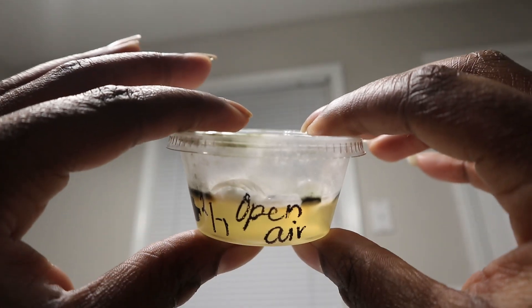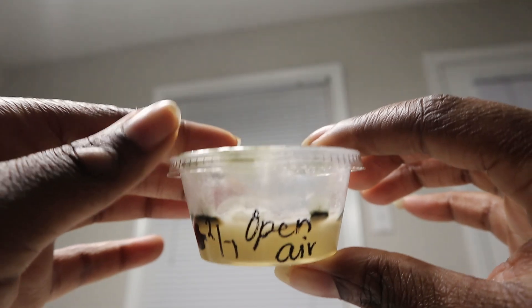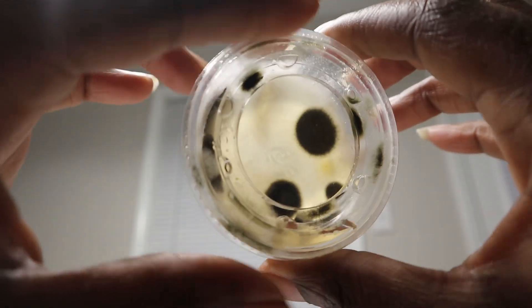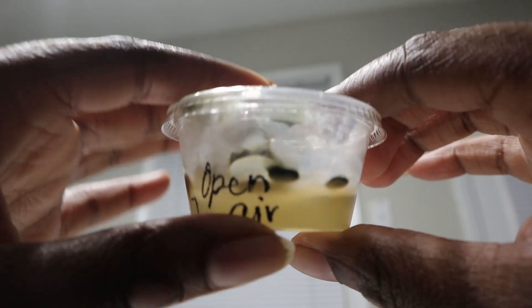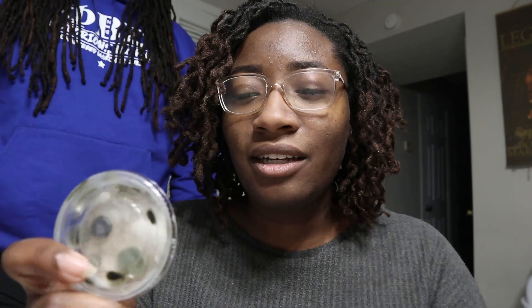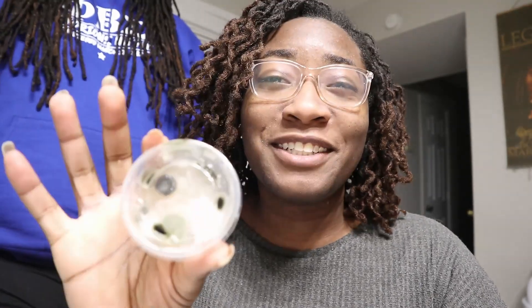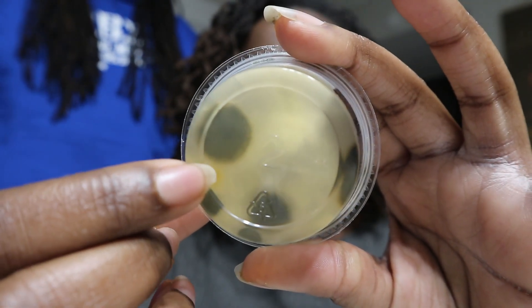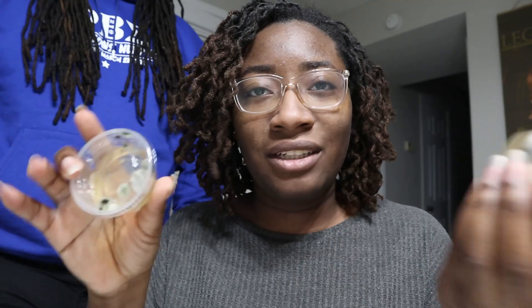The next one was open air, which was the first one we saw that had white mold. The other ones had the black-green common mold, but this one had a white mold on it. I only kept the open air one open for 30 minutes — actually, quality control here said I had the top open for two hours. It has this straw-colored growth on it.